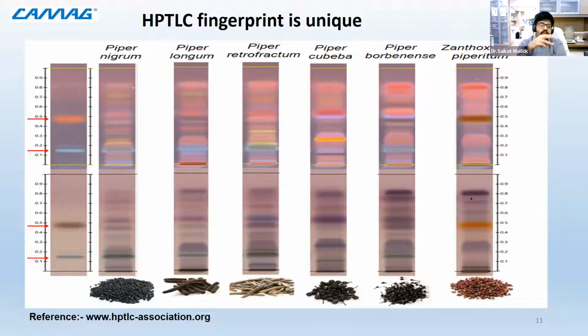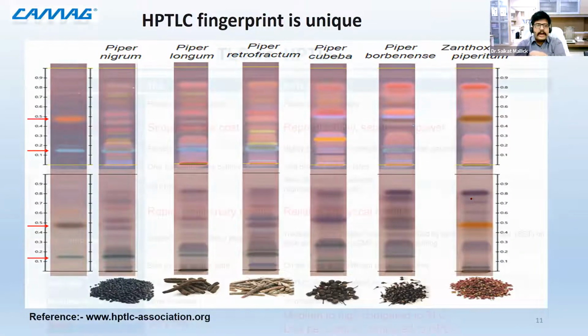And so these things which are going, and the changes which are happening, can be easily monitored, and you can take a call that yes, if my formulation is giving a response, that means definitely I have an activity and I can claim that. So there, this fingerprint approach is very applicable. Here I have given an example to show you differences between different species, but when I correlate to the studies of bioautography, this takes a different angle, which I explained to you right now, and how you can see it at different stages and understand what is happening.